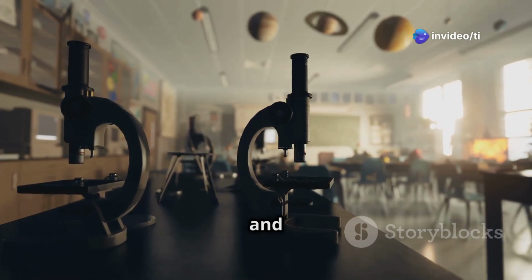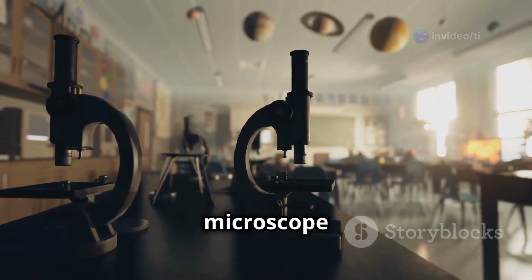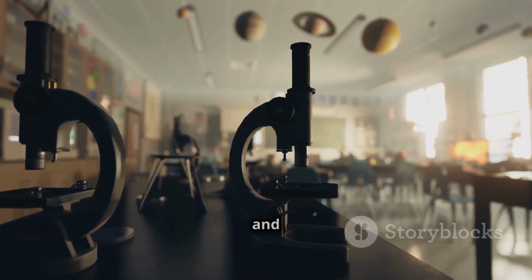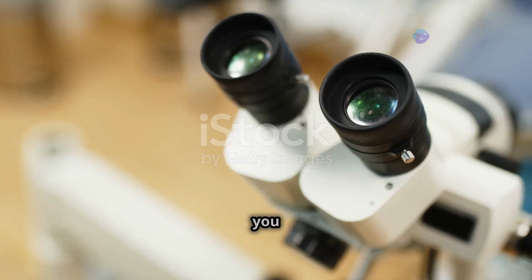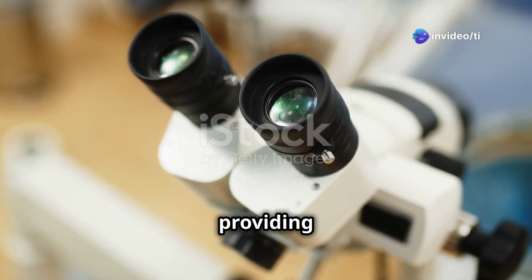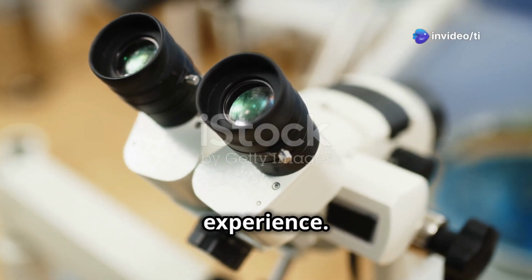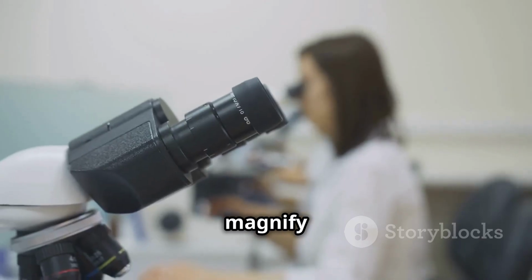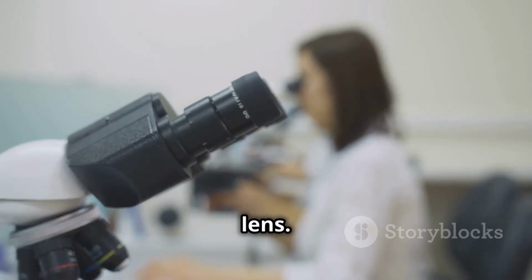Now let's get up close and personal with a specific type of light microscope, the binocular microscope, a staple in many labs and classrooms. Why binocular, you ask? Well, it has two eyepieces, one for each eye, providing a more comfortable and immersive viewing experience. Eyepieces are the lenses you look through. They further magnify the image created by the objective lens.